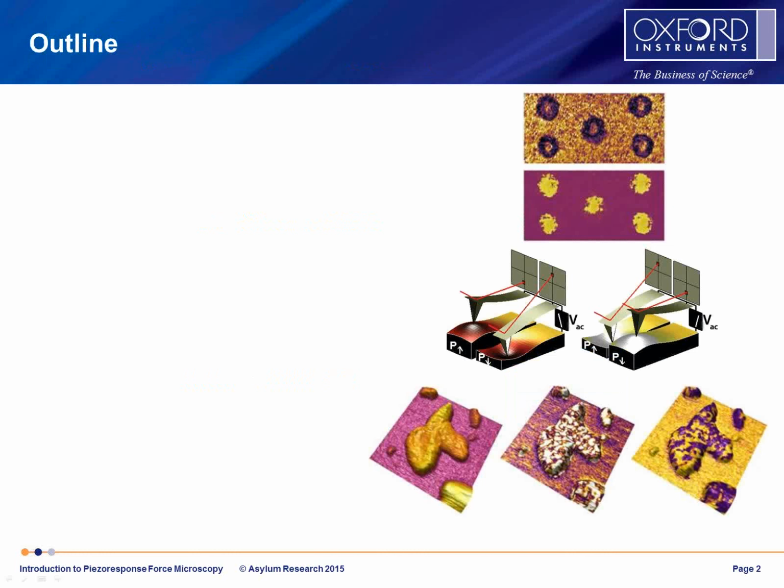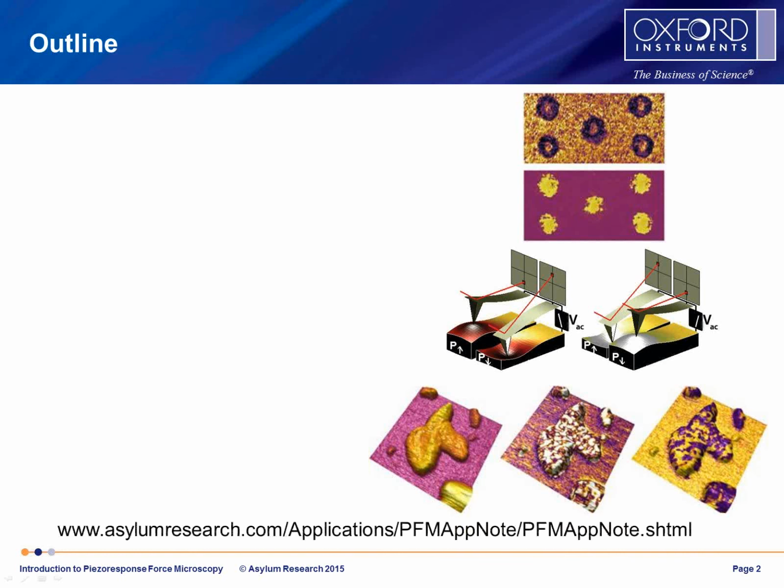Thanks for the introduction, Ben. I should say before we start that I got involved with this general field of PFM, Piezoresponse Force Microscopy, almost a decade ago. It's been a really great experience. There are a lot of smart people that work in this field, really interesting instrumentation challenges, and really great physics and material science. Today, I should note that a lot of the material you're going to see already appears in an application note that you can download from our website, at this address right below here.